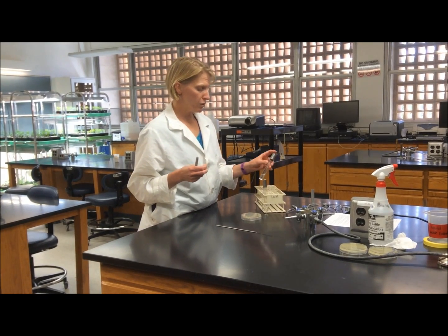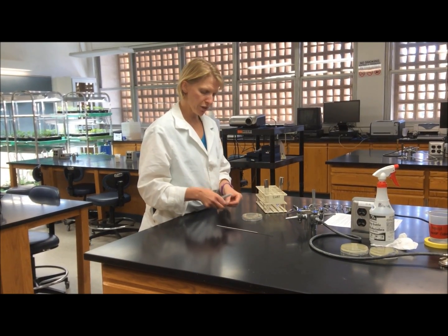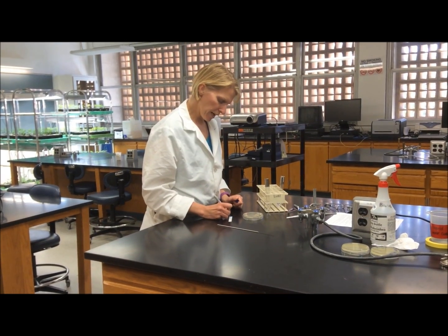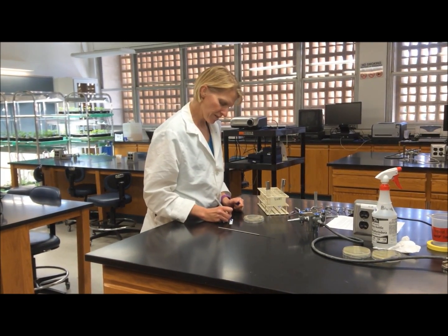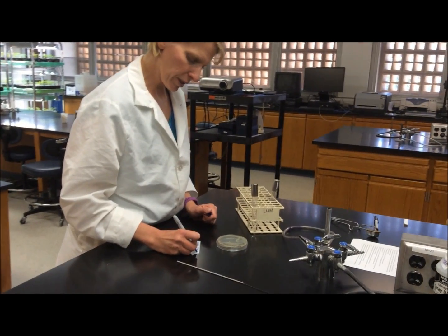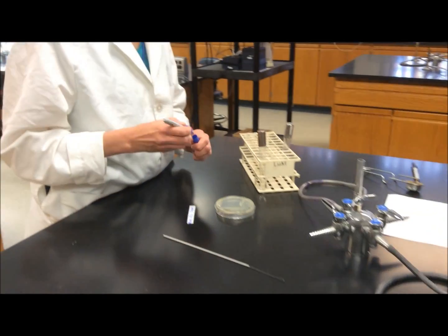The first thing you want to do is label the tube that you are inoculating your culture into. To do this, you can just take a piece of tape and write the name of your strain on the piece of tape, along with your initials and your date, so that we can keep track of the bacterial cultures.